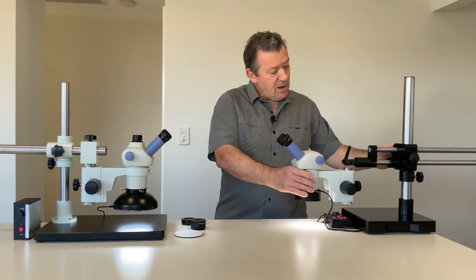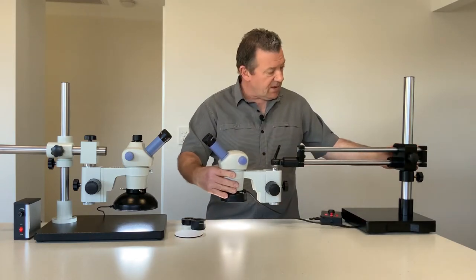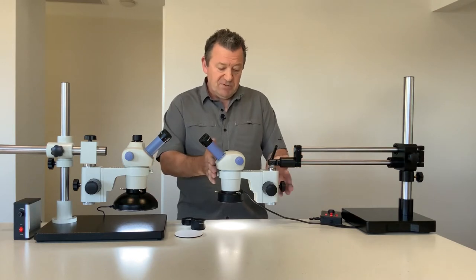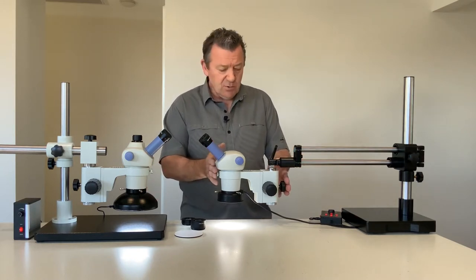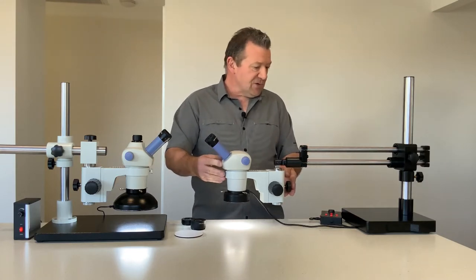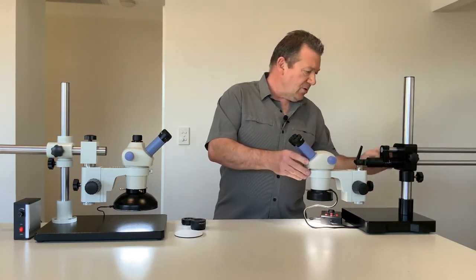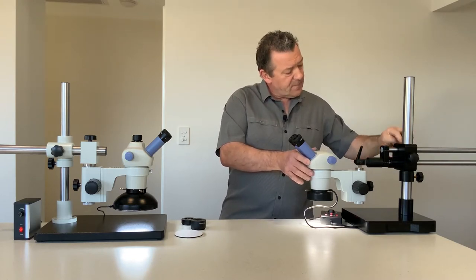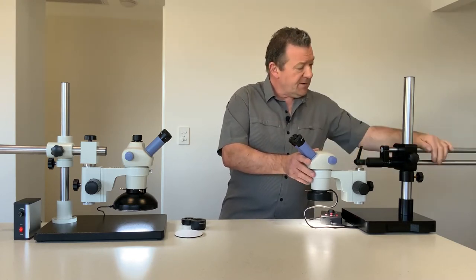This is your extra-large boom stand for looking at particularly large specimens — certainly used at museums or art galleries for art restoration. It's completely adjustable, mounted on ball bearing race heads.